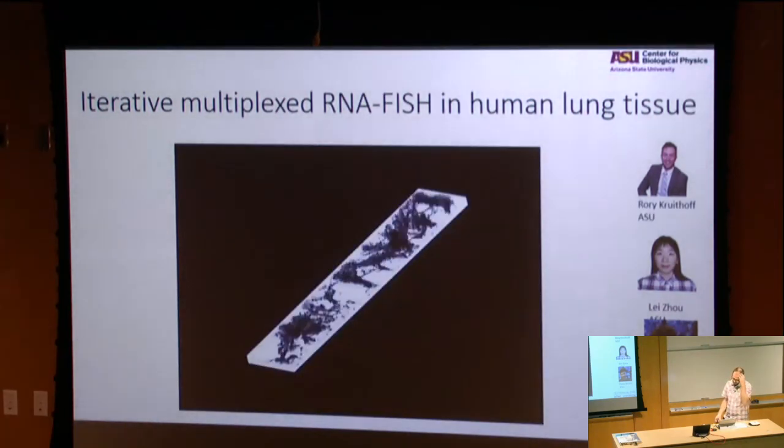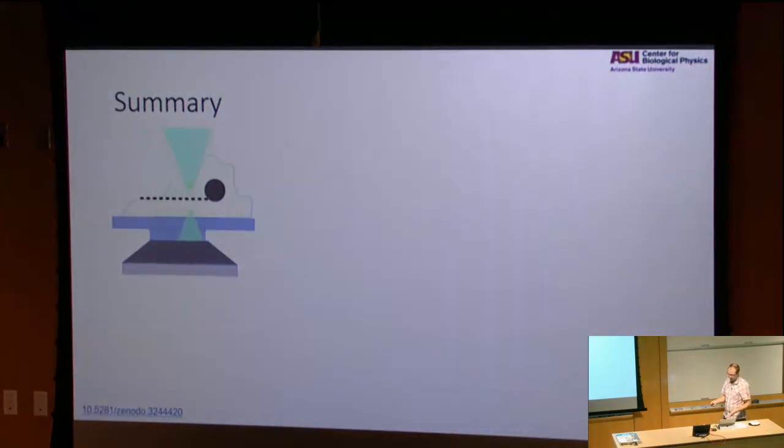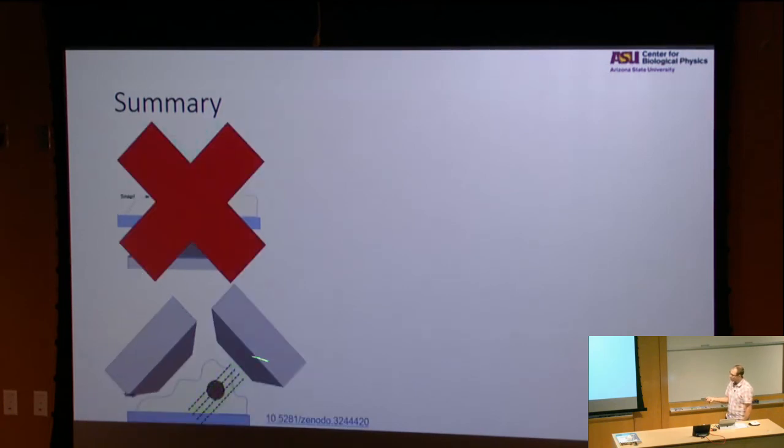Okay, so hopefully I've shown you two applications of thinking carefully about what measurement you want to do in biology. The big thing I want you to take away is that I really want people to stop using confocal microscopes if they don't need to for fluorescence microscopy. For things like two-photon or harmonic generation, it's obviously still the ideal tool. But for normal fluorescence microscopy, it would be really nice if everyone starts thinking about ways they can adapt these light sheet methods to move towards them.